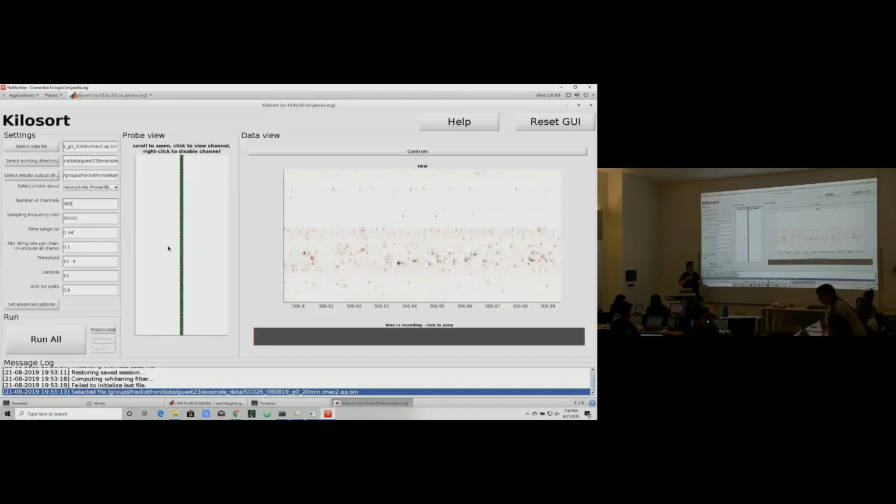But if you type by hand 385 in there? Yeah, it auto-corrects back to 410. I'm going to just make a guess here that you were copying this file and somehow it got interrupted and it didn't copy all the samples. And maybe just start over and copy that file over.